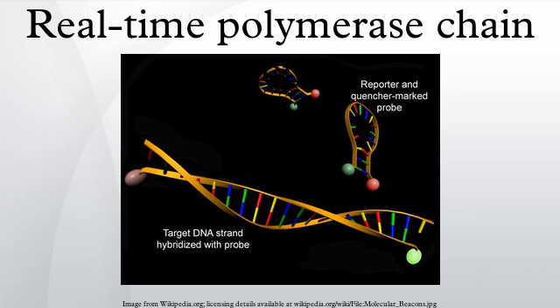Fusion temperature analysis. qPCR permits the identification of specific, amplified DNA fragments using analysis of their melting temperature. The method used is usually PCR with double-stranded DNA binding dyes as reporters and the dye used is usually SYBR green. The DNA melting temperature is specific to the amplified fragment. The results of this technique are obtained by comparing the dissociation curves of the analyzed DNA samples. Unlike conventional PCR, this method avoids the previous use of electrophoresis techniques to demonstrate the results of all the samples.